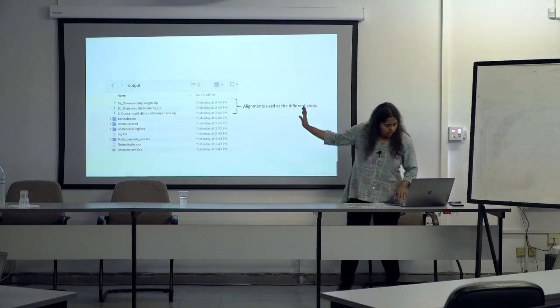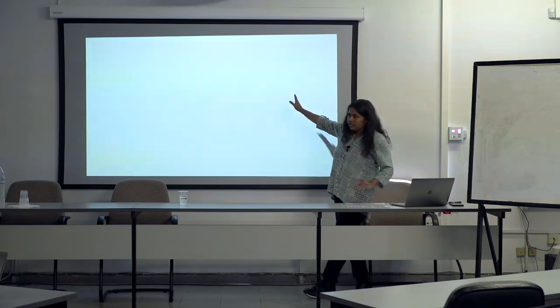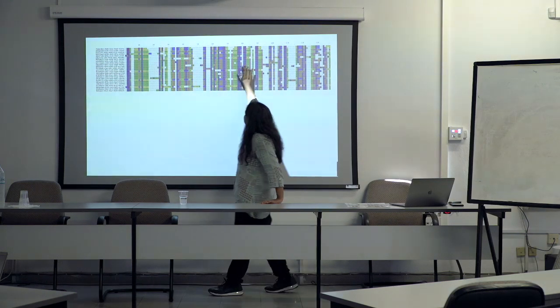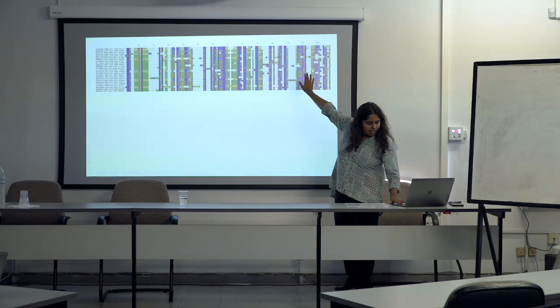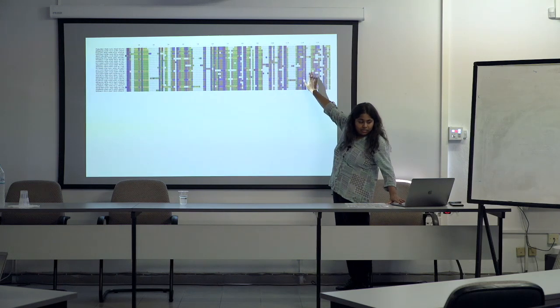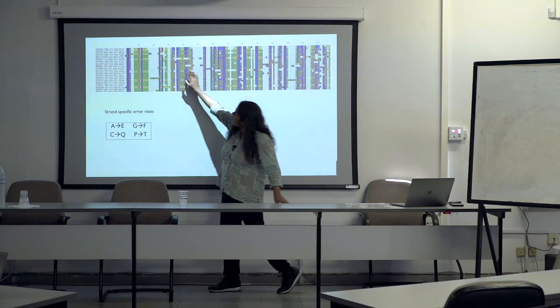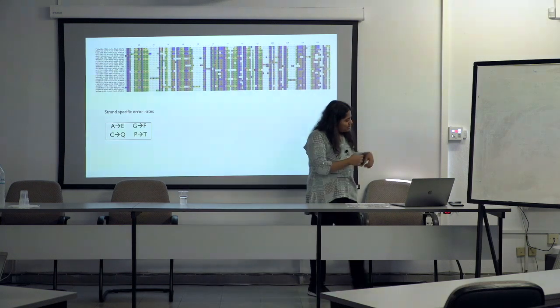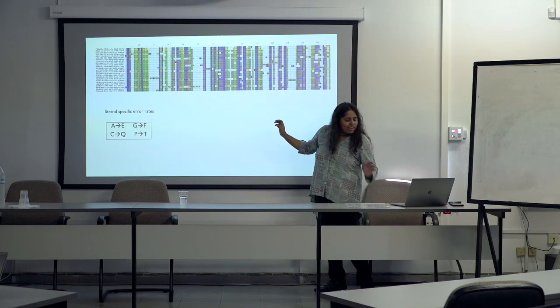you have the compressed outputs of the alignments. And I can show you what the alignments look like internally. So this is one of our data sets, and what you can see is this is an R9.4 run. And you can see there are a lot of differences. But one of the things you will notice in our demultiplexing file is a recoding of ATGCs to EFPQ.